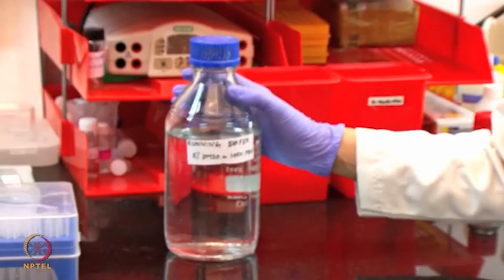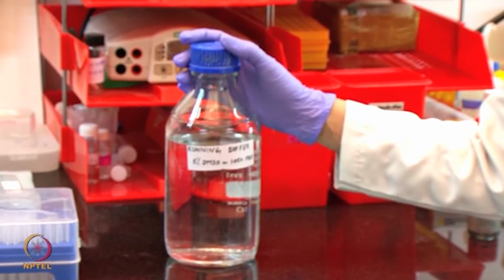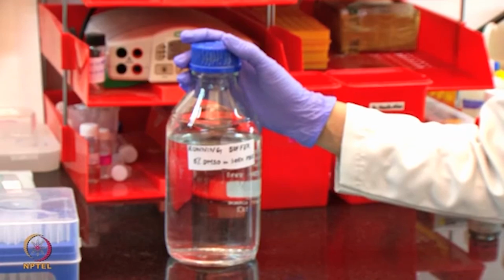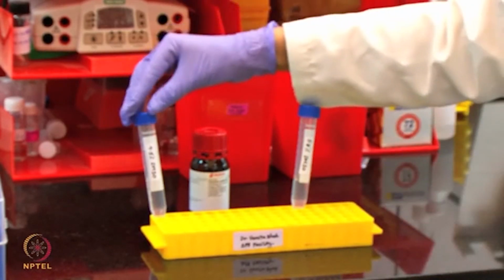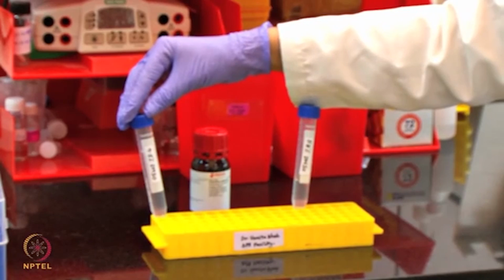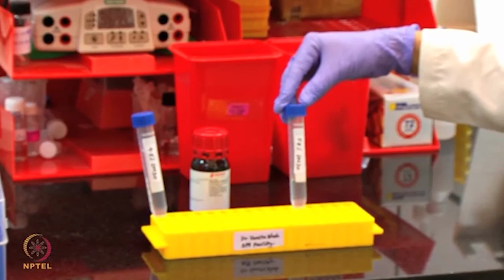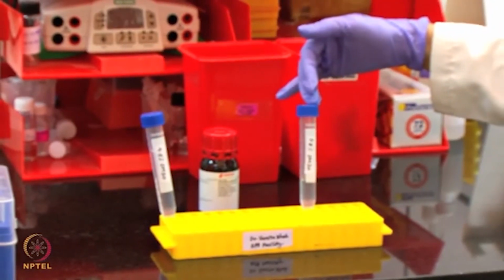In this study, we will again be using 5% DMSO in 1.05x PBS as the running buffer, which will also be used for the initial startup cycle. As prepared in the screening assay, we will again prepare 8 different solvent correct solutions ranging from 4.5% DMSO in PBS to 5.8% DMSO in PBS by mixing these two solutions in different ratios.